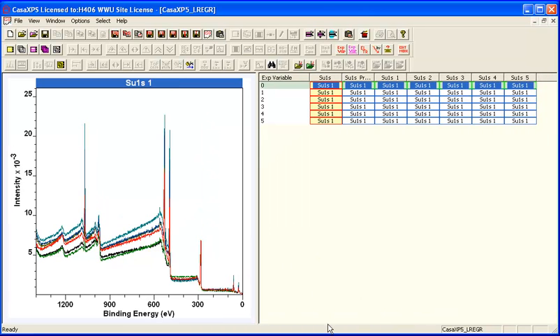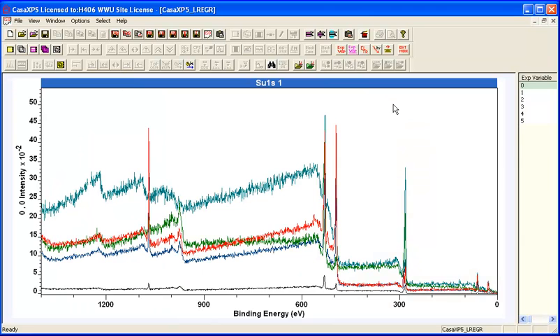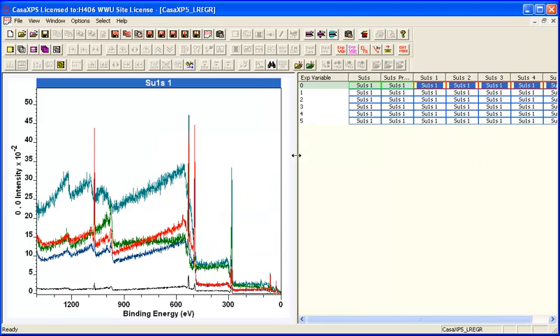And the analysis that is performed using these survey data is to construct 5 component spectra. These columns here are component spectra that have been calculated from the data set as a whole. So these other 6 survey spectra have been used to construct these spectral forms, and these spectral forms are hopefully, and you always have to be hopeful of this, hopefully showing us some chemistry.